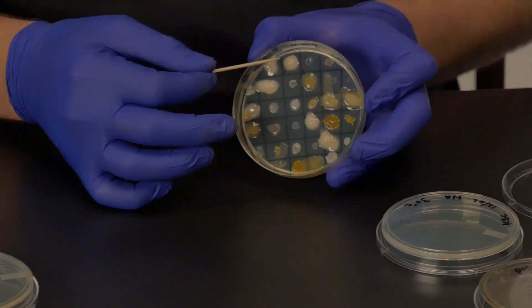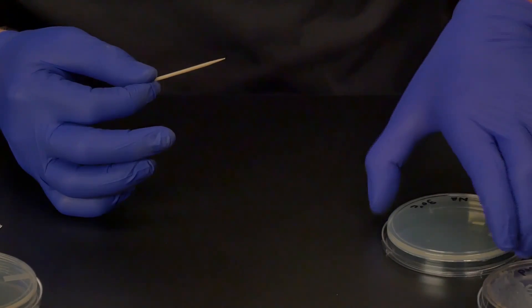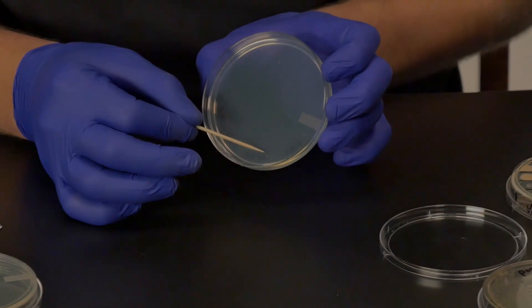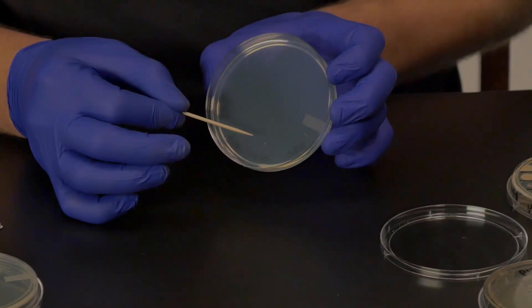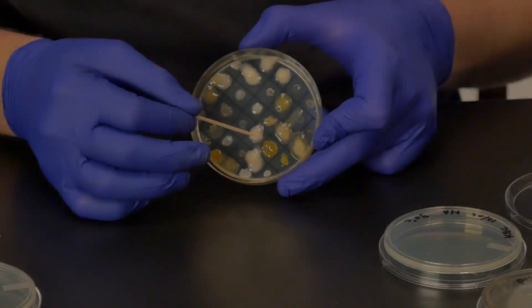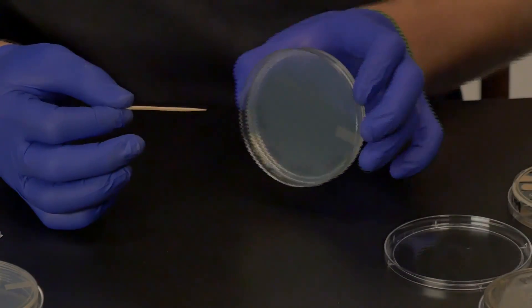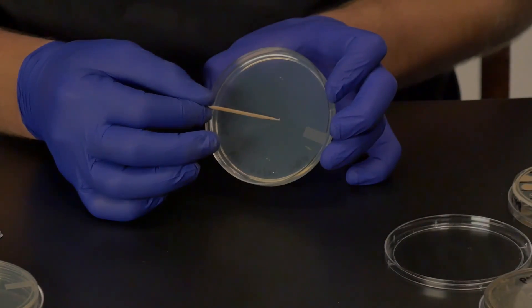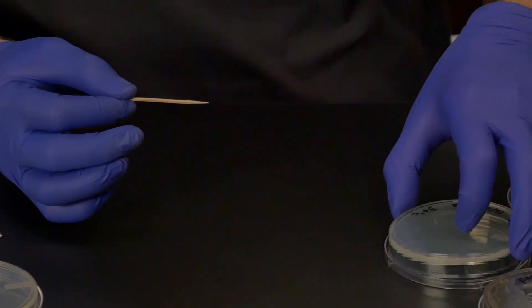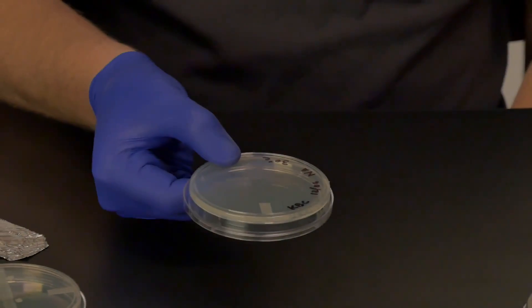Now apply the negative control in similar fashion. Take a sample from one of your soil isolates that has not shown a zone of inhibition against this pathogen on any of your prior plates. With a sterile toothpick, transfer the negative control by placing it as close to the line as possible, then apply another sample on the opposite side of the pathogen line. Finally, do the same with the proof, using a sample from the master plate of the soil bacterial isolate in which you had previously shown a zone of inhibition against this pathogen. Replace the lid, turn the plate over, and incubate.